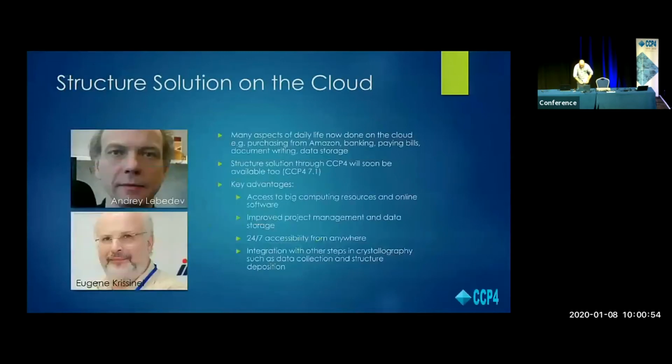So the CCP4 Cloud was a BBSRC grant project that we did a few years ago, and it's mostly been developed by these two chaps, by Eugene and Andre in our core team. And the idea was basically to produce a cloud-based way of doing structure solutions.